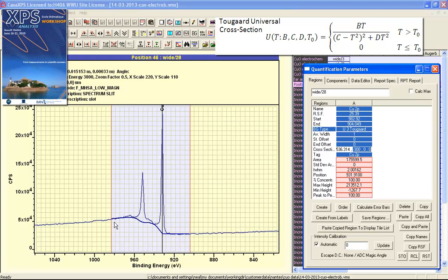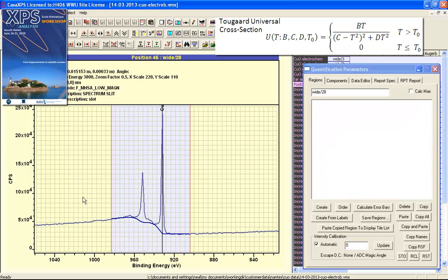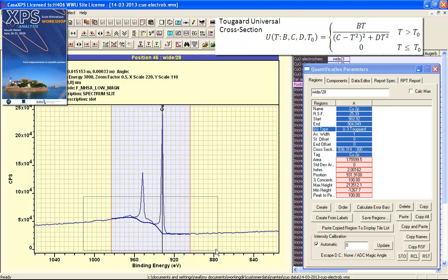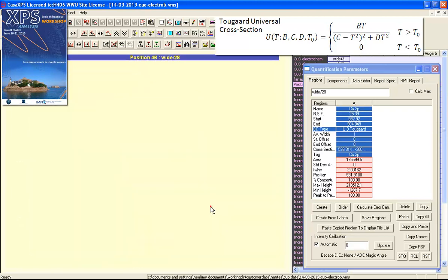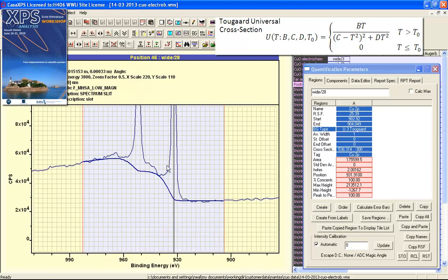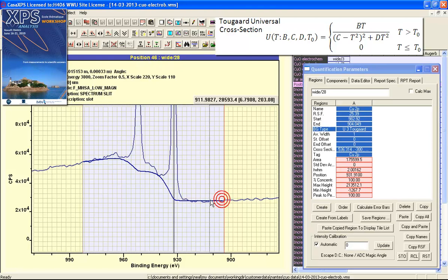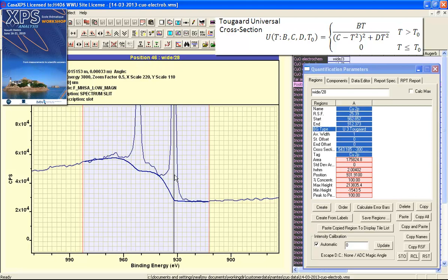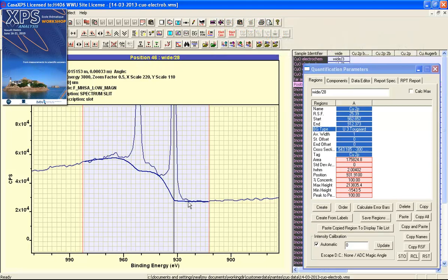It scales in order to force the background to meet the data at the start of the interval. The Tugar background is an example of how the photoemission signal is partitioned into a signal that can be assigned to photoelectrons—that is, electrons ejected as a consequence of the photon—and inelastic scattering of electrons.